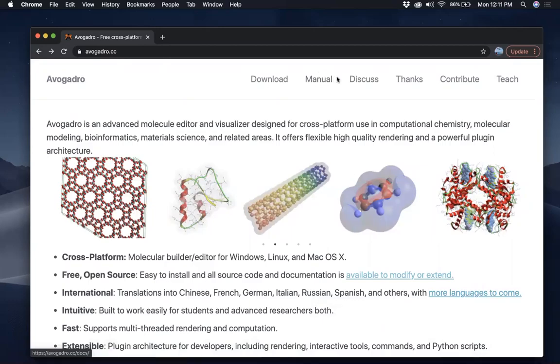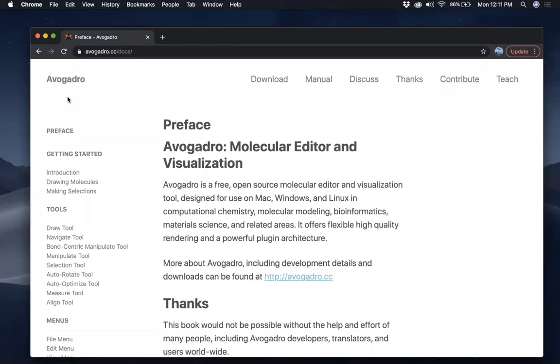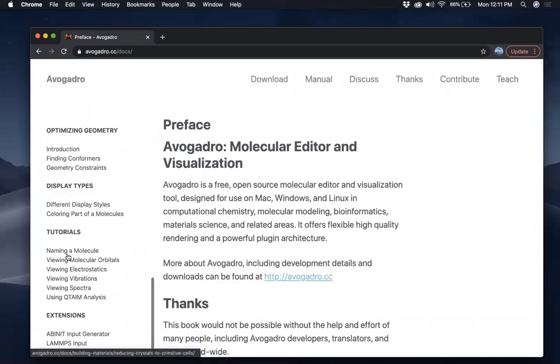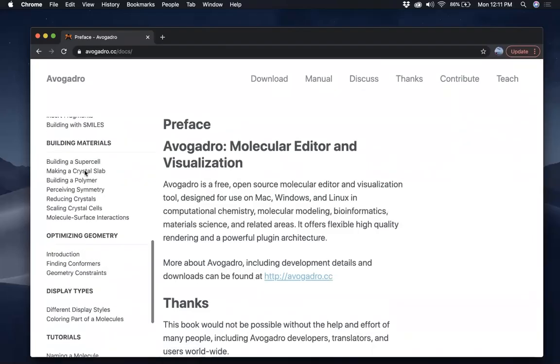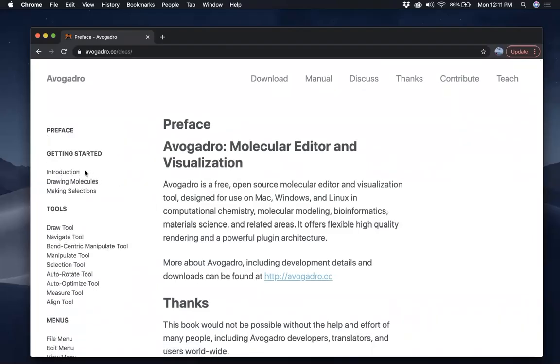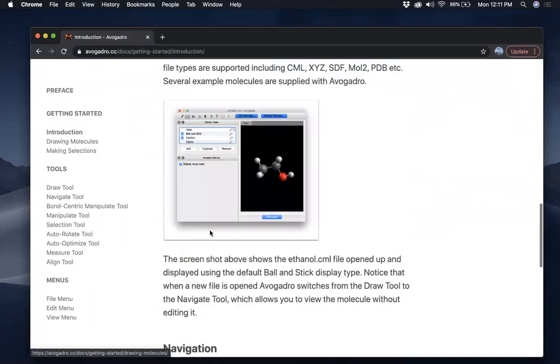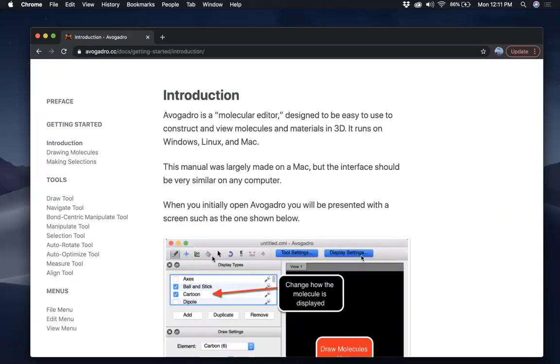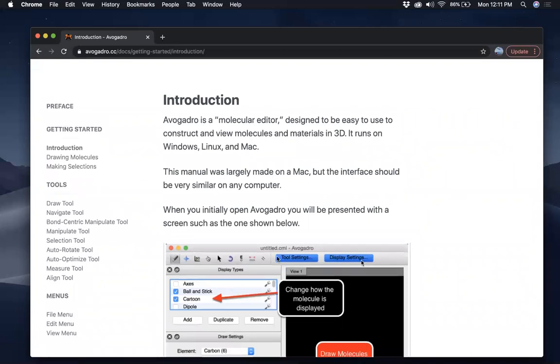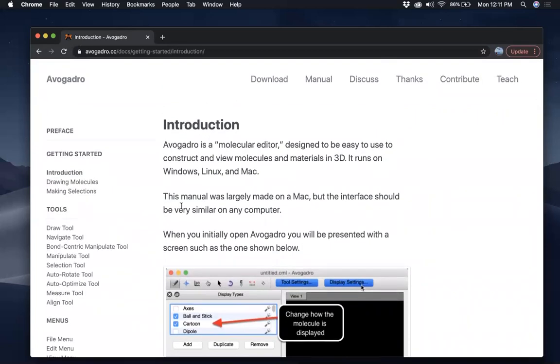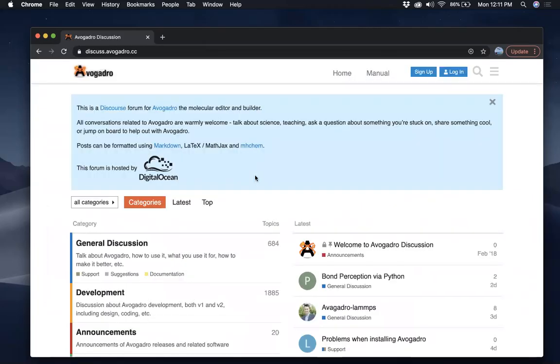The next thing here is the manual, and it's pretty detailed. So in today's tutorial I'm just going to cover the introduction — show around a little, talk about the different tools, and tell you how you can save a file and how you can open a file, just getting started with Avogadro. And here there's a place where you can discuss.